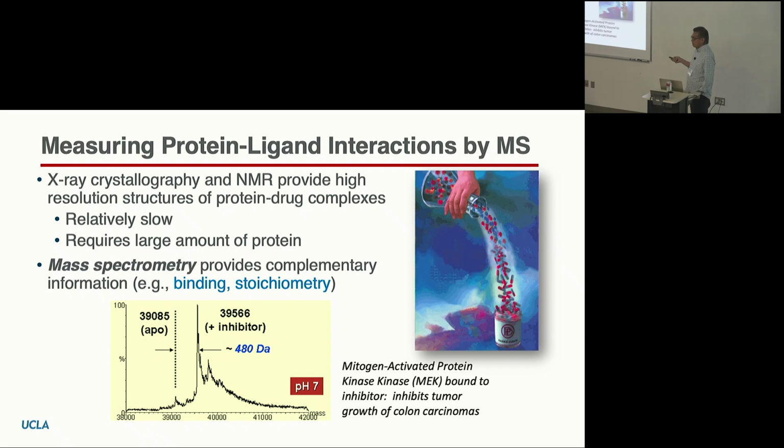We were doing these kinds of native mass spectrometry measurements to take compounds that medicinal chemists would make. They would decide that this compound they think targeted this particular enzyme. We would take those sets of compounds and measure the binding of that molecule to the protein target. If the molecular weight shifts by the according mass of the drug, we can say, yeah, it binds. Or we can say 2 molecules of drug bind to the protein, not 1 molecule. So we can give that kind of feedback.